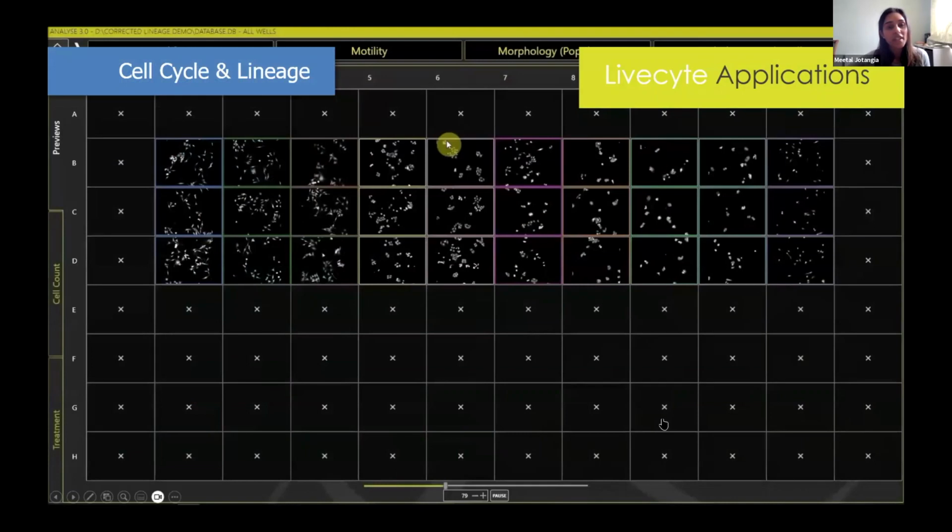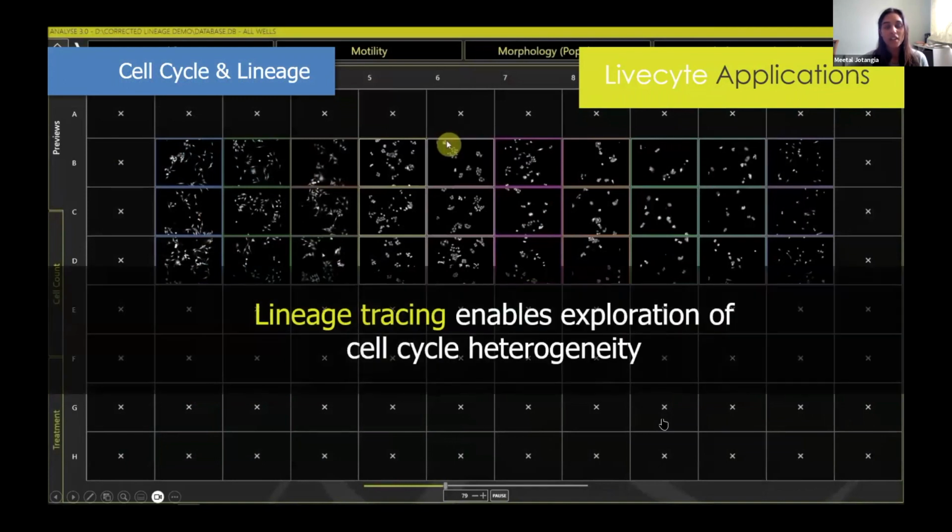What it also gives us is single cell information on the cell lineage. So this is something that's very much a single cell exclusive. So it's something that we can do because we're able to segment and track and understand mitotic events in more detail.